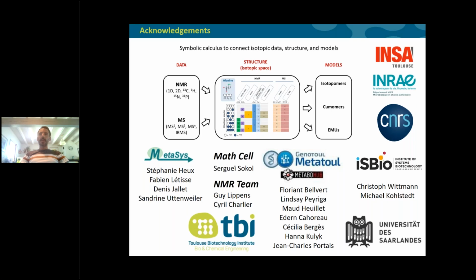It's not yet available on Workflow4Metabolomics, but it's in the plans to implement IsoSolve. For now, you can use it on your own machines. Everything is available on PyPI. It's very simple to use, and there is extensive documentation which is also available online. But we will do that. I hope by the end of the year it will be available on Workflow4Metabolomics.